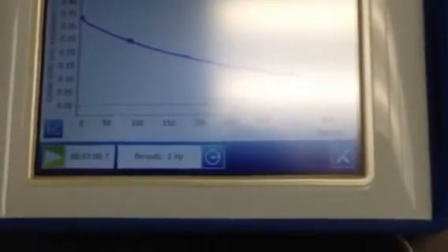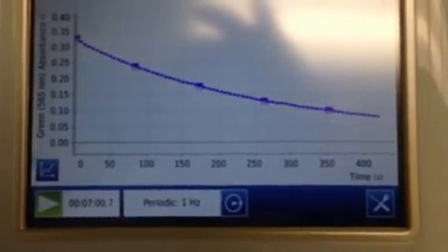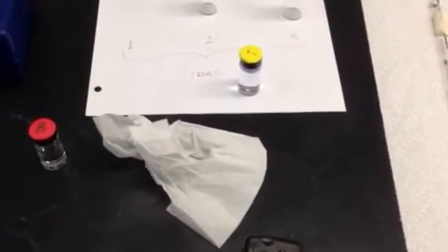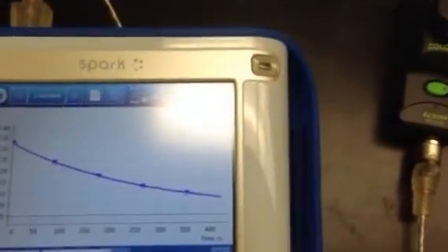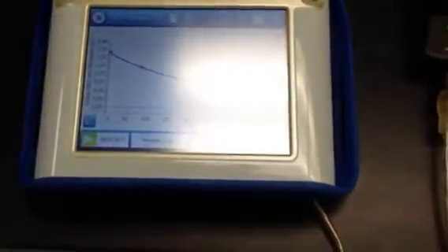The run should go until the absorbance drops below 0.1 — you can see 0.1 there. It should not take more than seven minutes for each run to be completed, and you're going to do this for all three trials. Since there are at least two of you in the group, one person can hold the cuvette while the other adds the chemical, then cap it, shake it, invert it, and put it in. Two of you can do this pretty quickly. Altogether the run should take no more than half an hour, so we should be done with this lab within 45 minutes, leaving 45 minutes at the end of the period to review calculations and analysis.